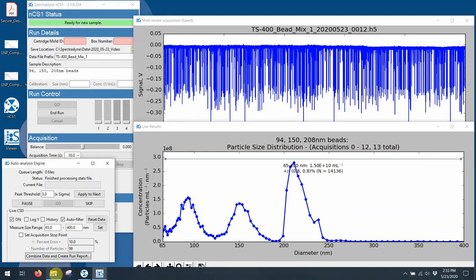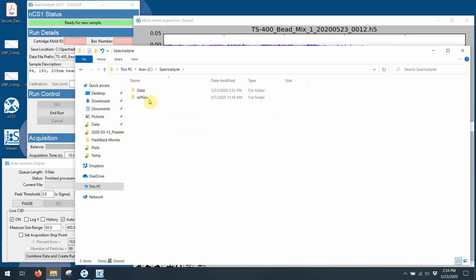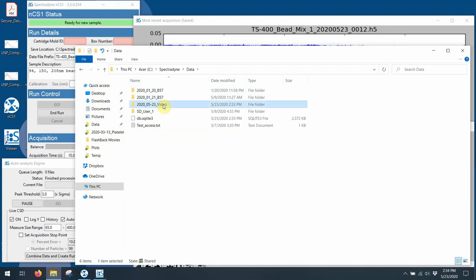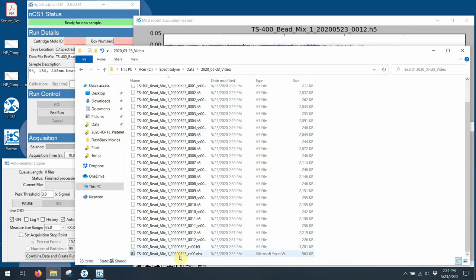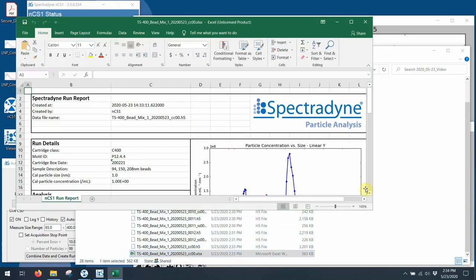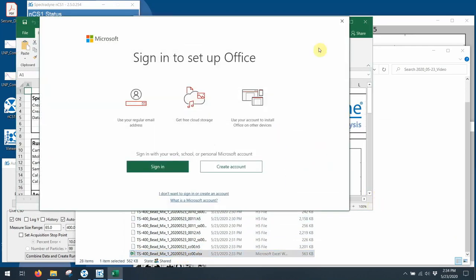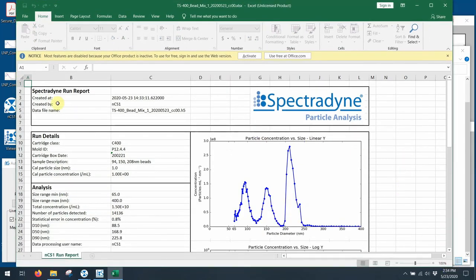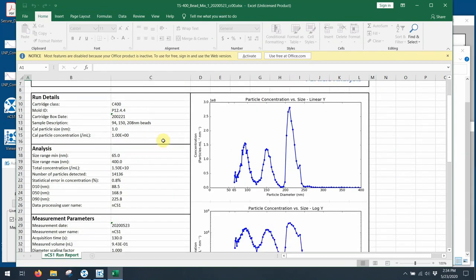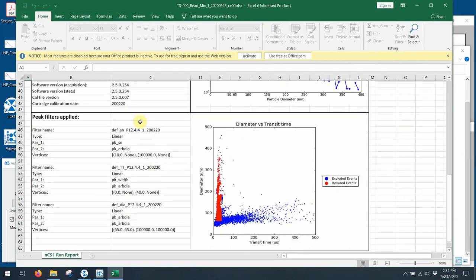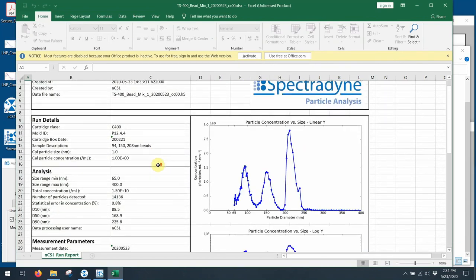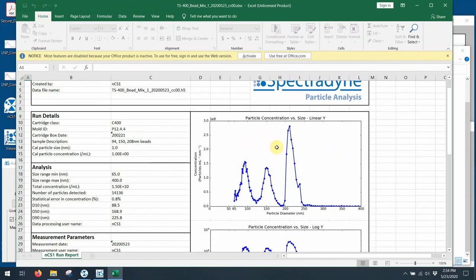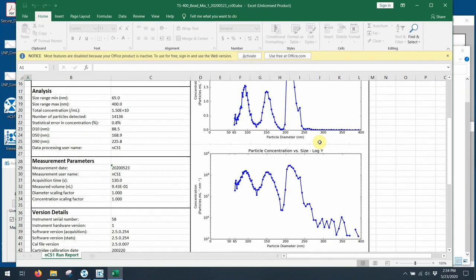I've also created a report file, which I can go look at by going into my data file. And if I scroll down, I should see the bead mix right here. And here's the report created. And so you can see that this is the run report, date created, unique name for it. The CC indicates this is a combined file. And it shows my cartridge mold ID, box date, sample description, which is the metadata I put in. It tells me if there are any filters applied, which there were, to remove noise. And then it shows me my distribution in a linear fashion and a logarithmic fashion. So this is a default report.